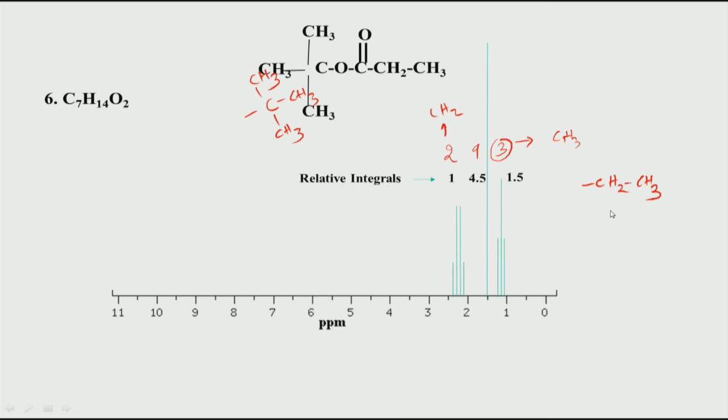This is what we discussed. You could say, why do not we flip it to the other side, so that this O comes to this side? But if that were so, then this OCH2 would have come somewhere at 4 to 5 ppm, which is not what we are seeing here. Therefore, this oxygen is on this side and not on the other side, and this is what we get.